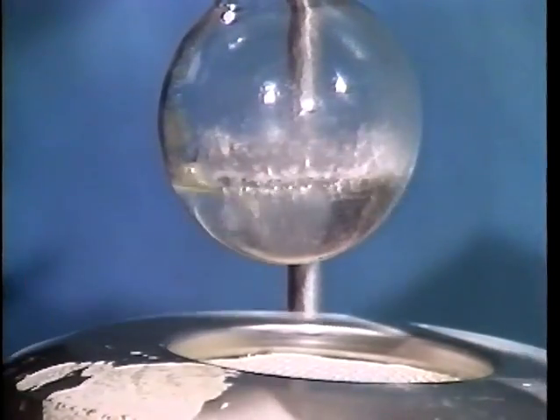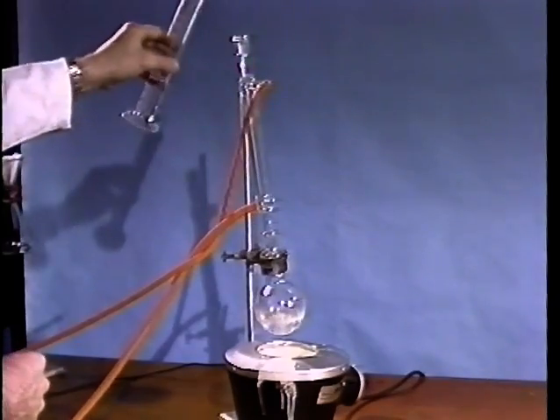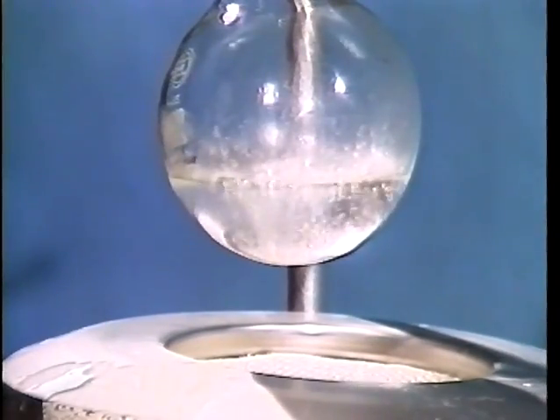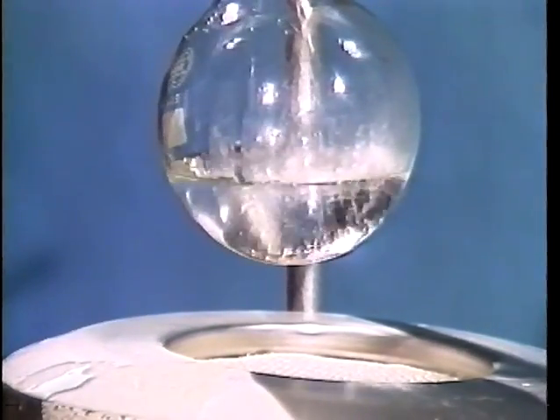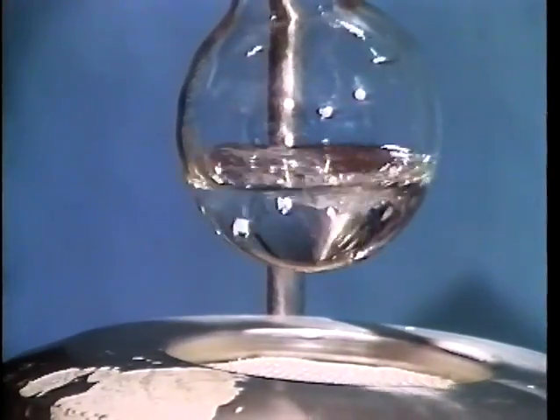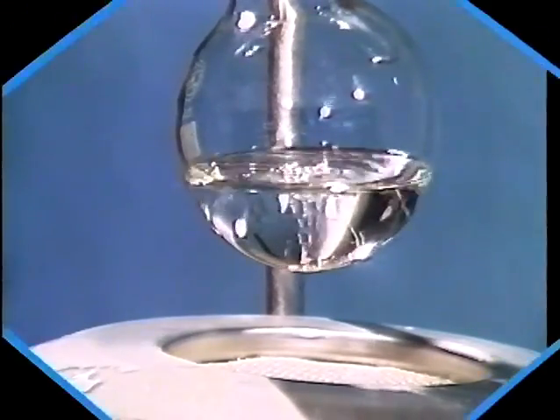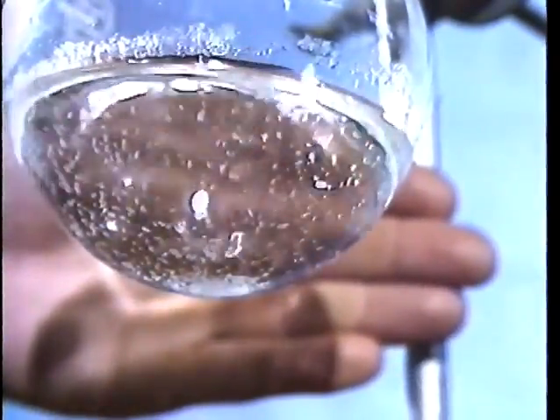If the turbidity persists even on boiling, you have added enough of the second solvent. You then add a trace of the first solvent such that the turbidity just clears. The solution is then left to cool and crystallization is induced as before. In this case, the solution was left overnight at room temperature and the result was these rather large crystals.